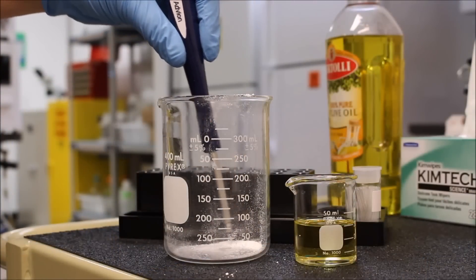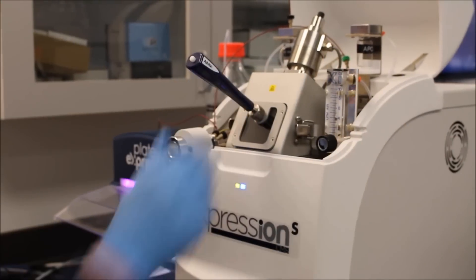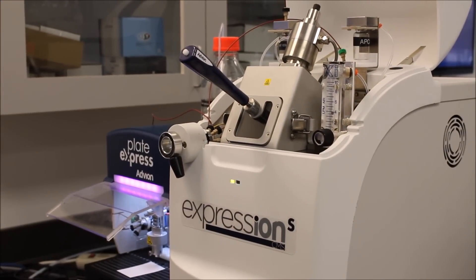Swipe the tip of the probe across the sample of interest and then insert it into the mass spec for instant results.